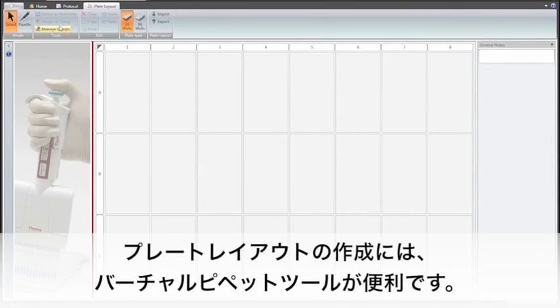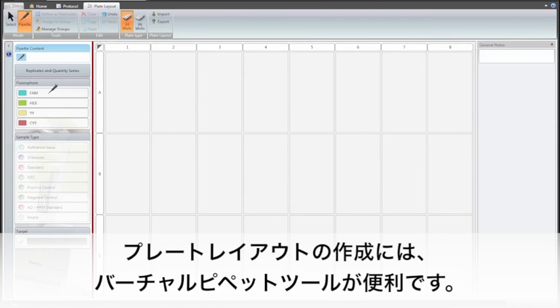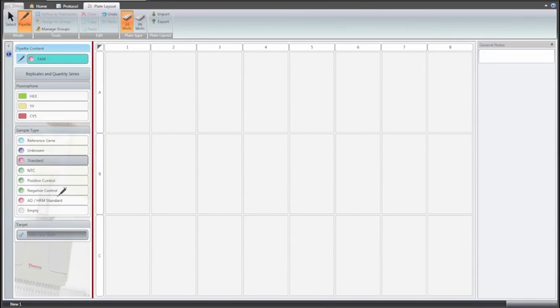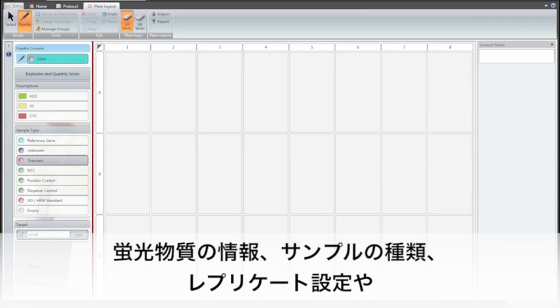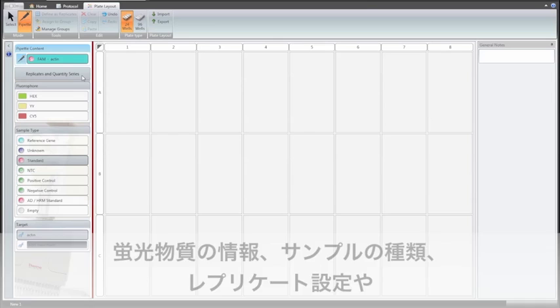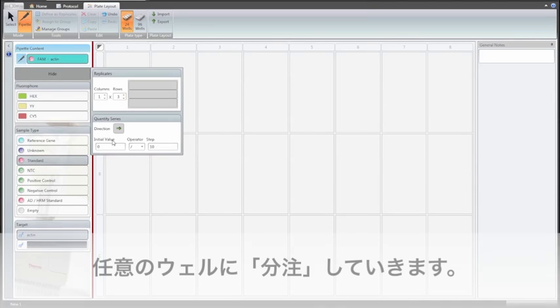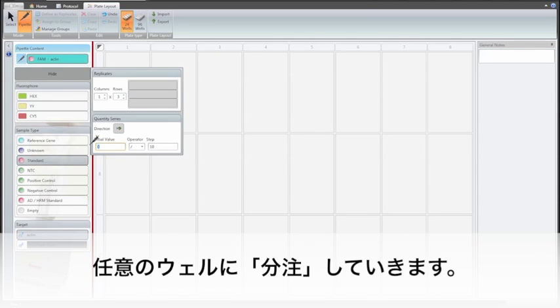Creating a plate layout is convenient and fast with the virtual pipetting tool. The information of the fluorophores, sample types, replicates, targets, as well as concentrations for standards, is loaded to the virtual pipette tip and then pipetted to the designated wells.